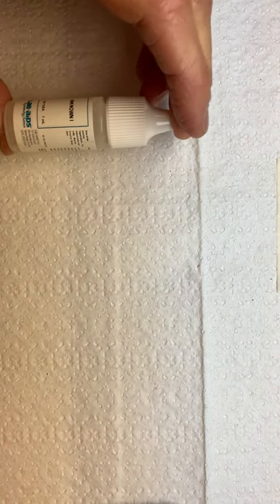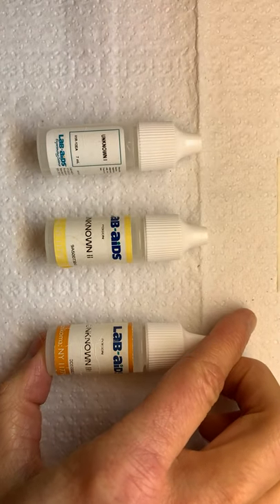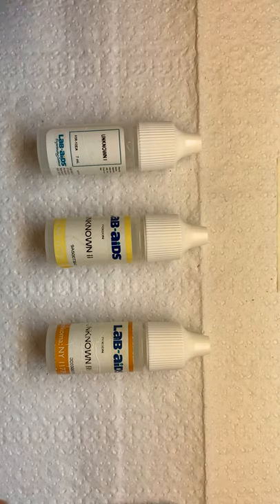We'll have one more thing to add. We have three unknowns: unknown 1, unknown 2, and unknown 3. We're going to discover what the pH of those is in a little bit.